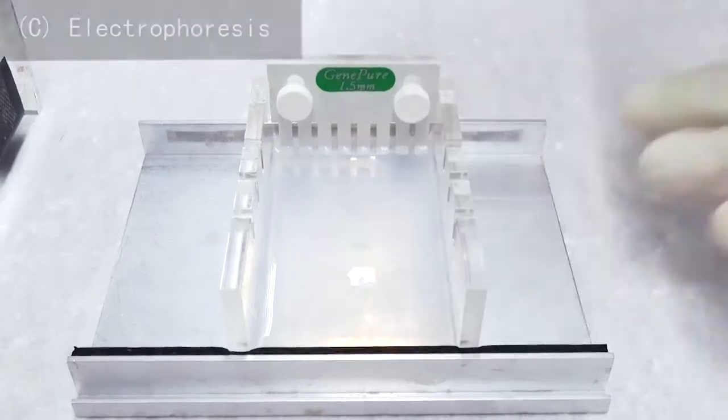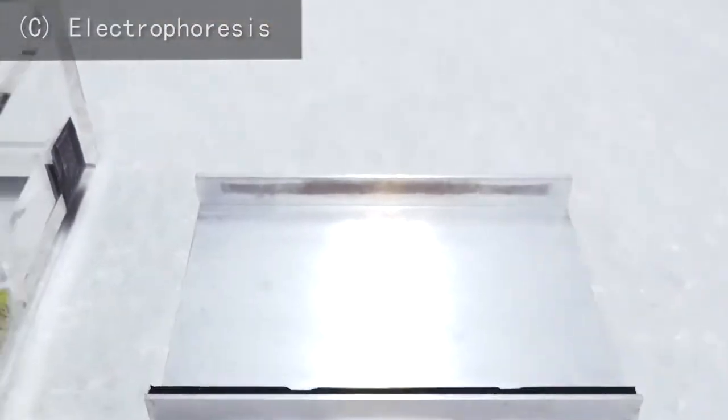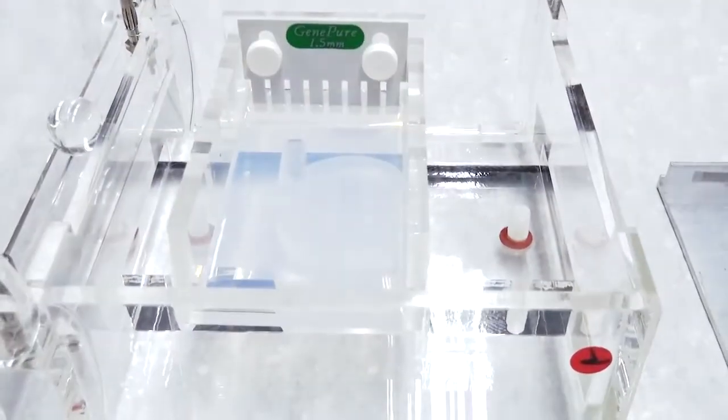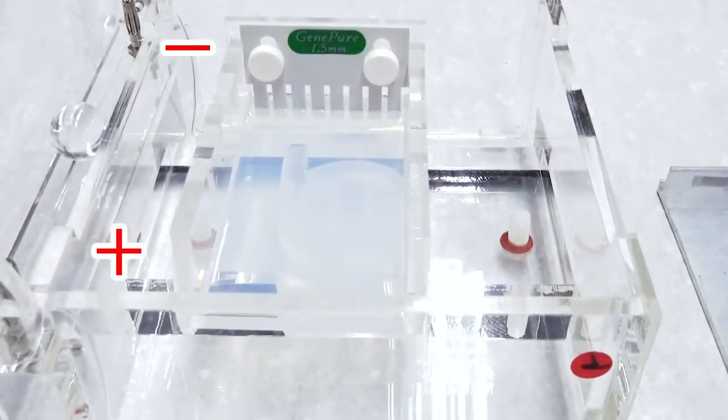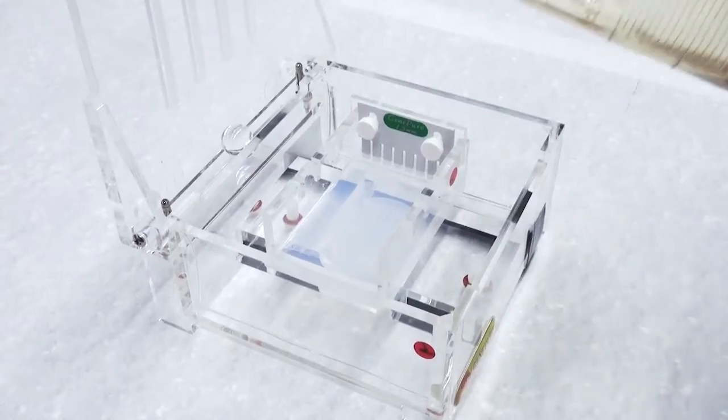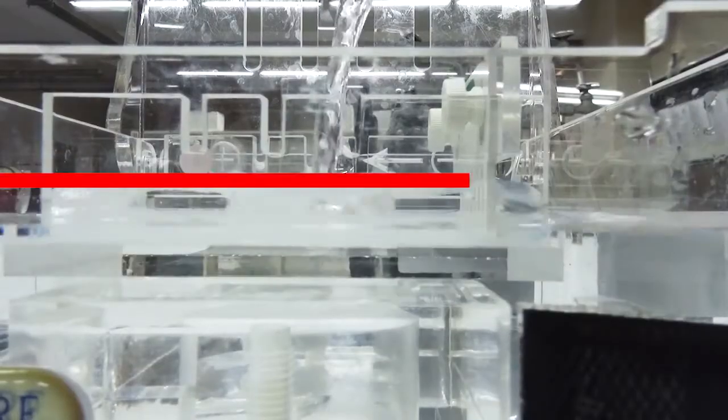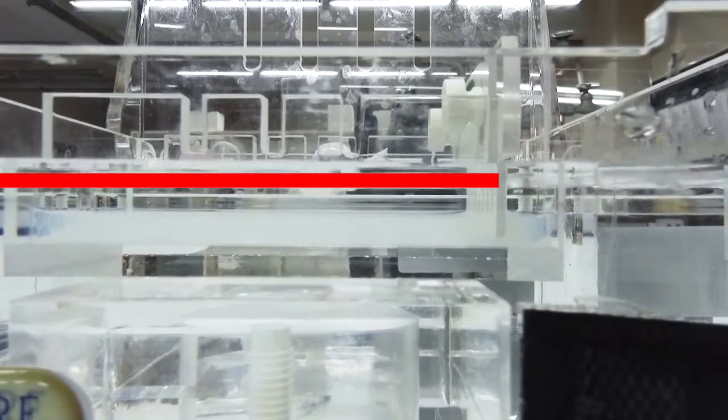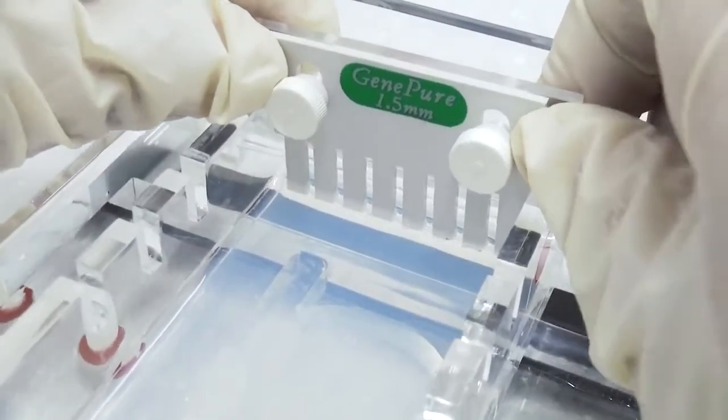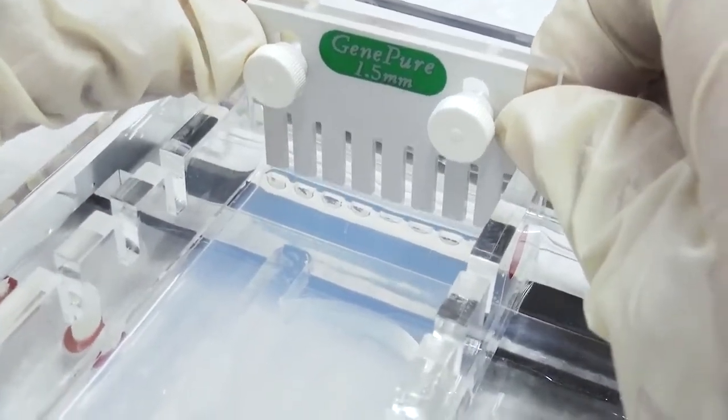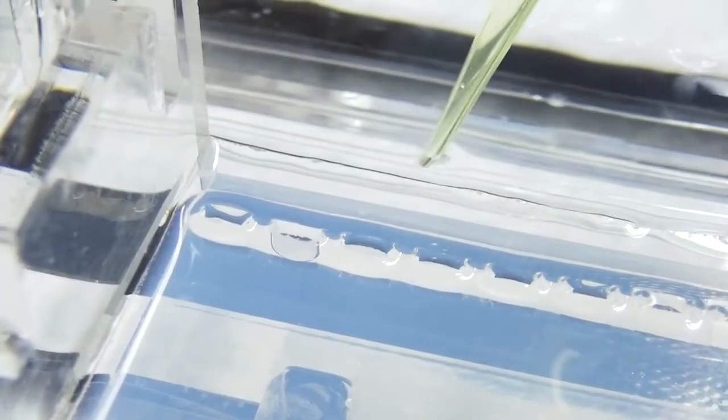Install the gel tray holding the solidified agarose gel into the electrophoresis tank. The side of the gel with the comb should be at the negative electrode. Pour enough electrode buffer into the tank so that it just covers the gel. Remove the comb gently. Wash the loading wells with electrode buffer to get rid of bubbles.